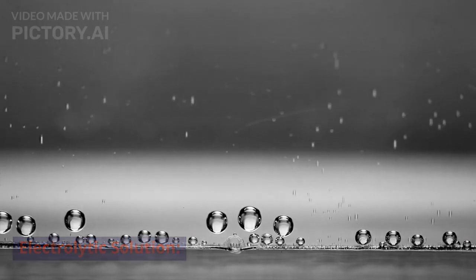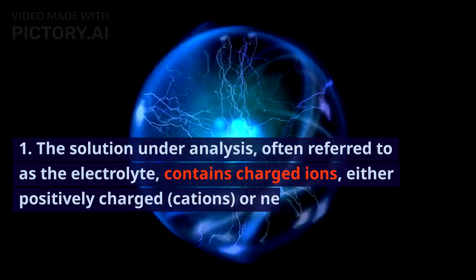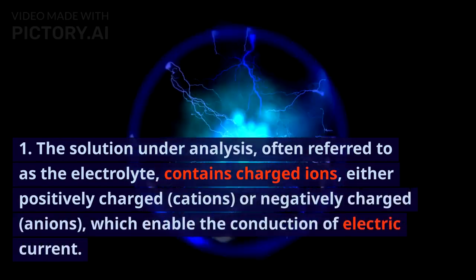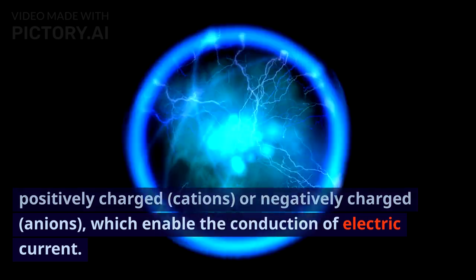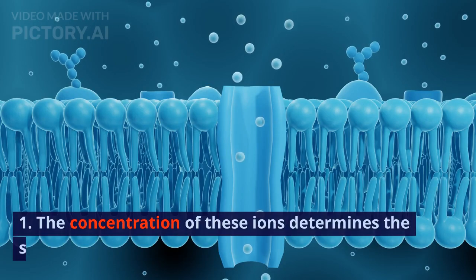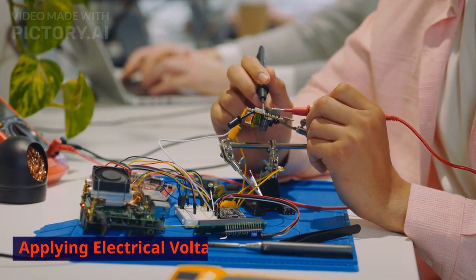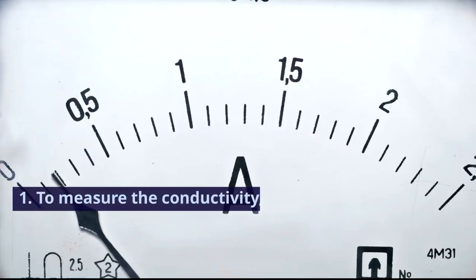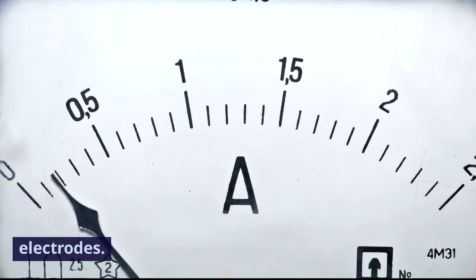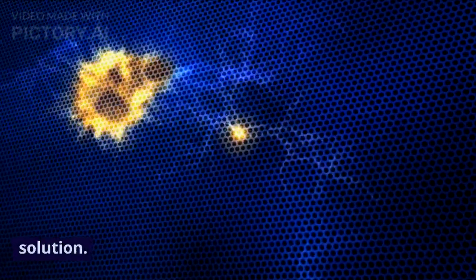3. Electrolytic solution. The solution under analysis, often referred to as the electrolyte, contains charged ions, either positively charged, cations, or negatively charged, anions, which enable the conduction of electric current. The concentration of these ions determines the solution's conductivity. 4. Applying electrical voltage. To measure the conductivity, a small, known electrical voltage is applied across the two electrodes. This voltage creates an electric field within the solution.